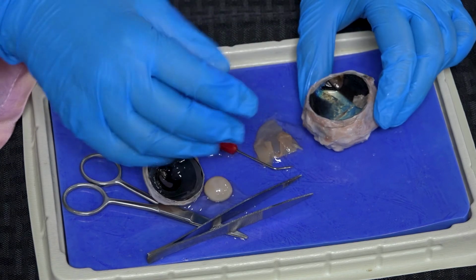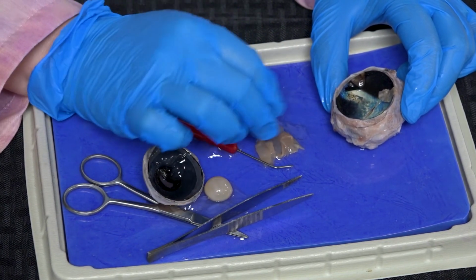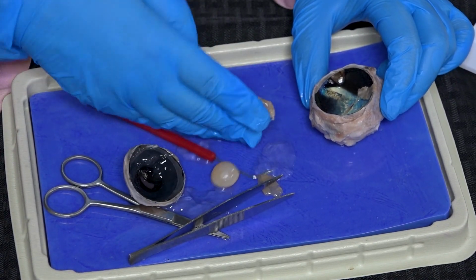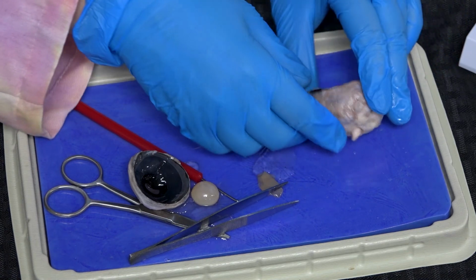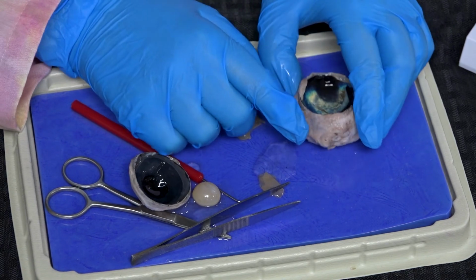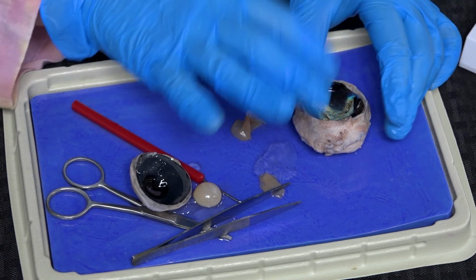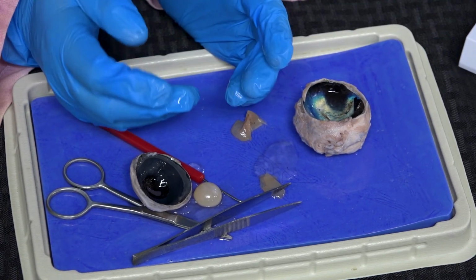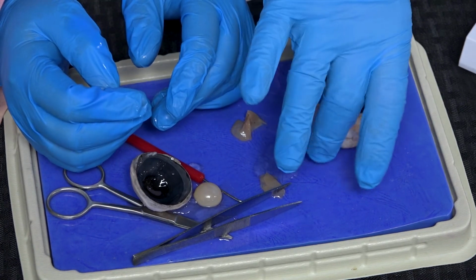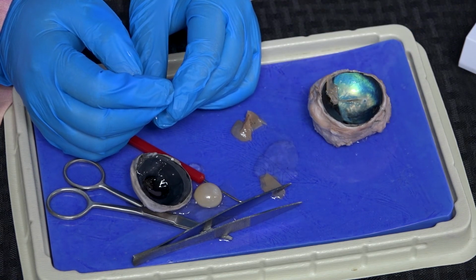After the light has passed through the eyeball and been collected on the back, on that retina, on this tissue here that just looks like wet brown tissue paper now, it will go through the optic nerve at the back of the eyeball to get processed by the brain. So there it is. That's the cow eye, and very similar to a human eye, except for that tapetum lucidum. It's pretty similar in size and overall structure. Even the texture, if you squeeze it, you can feel how the human eye would feel. I'm glad I'm using this hand for that and this one for my eye.